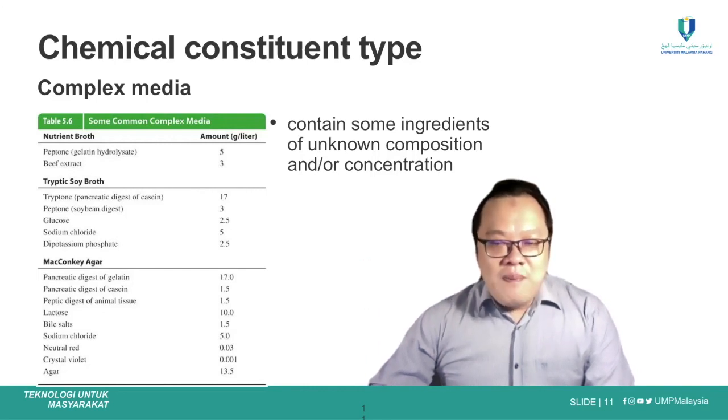All these are complex nutrients whose exact chemical constituents are not known. Therefore, this is what we define as a complex media.